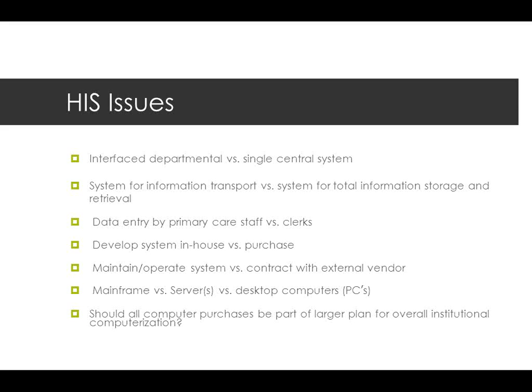Were you going to put it all on a mainframe versus servers, which is our typical process now, multiple servers, versus the old approach of running it out to lots of different desktop computers and PCs? Well, we have PCs as clients, but they typically can't hold the entire system within them. So typically it's a server and mainframe process.